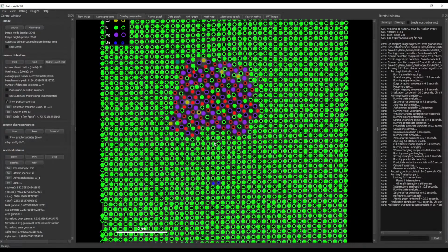And so let's say I wanted to check that this is a good result, that it is correct. I would have to ask, okay, is this correct? And okay, is this correct? And so on, and it would take forever. So to remedy this, there's something called atomic graphs, which we have been using to run this important part of the algorithm.